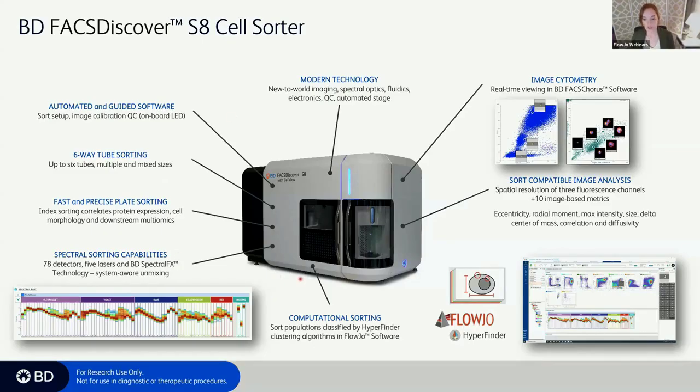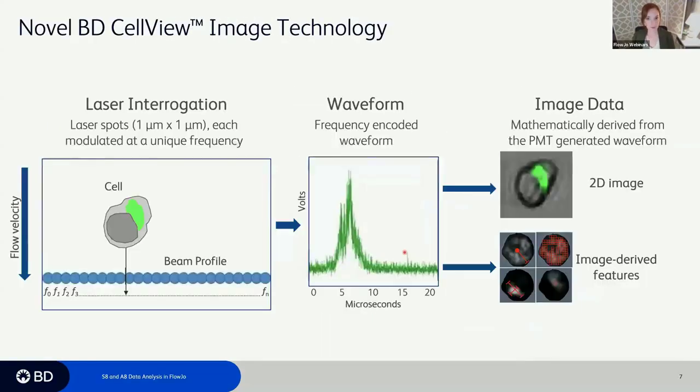This all has more to do with the handling of the samples themselves. But just to give you an idea that it's a very powerful instrument. We can get more measurements than we ever have before. So what's distinct about the CellView image technology itself?